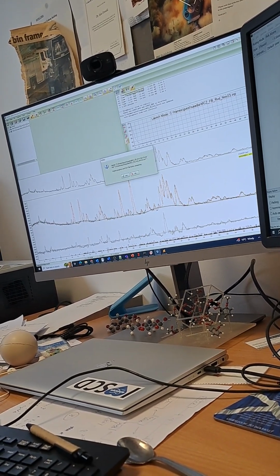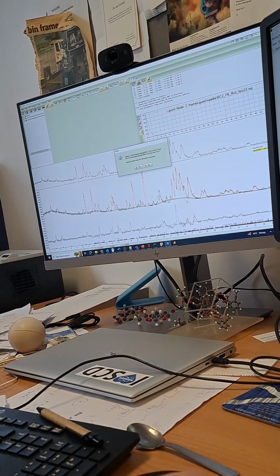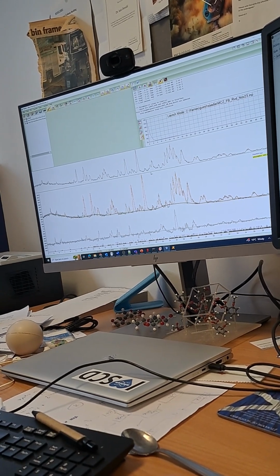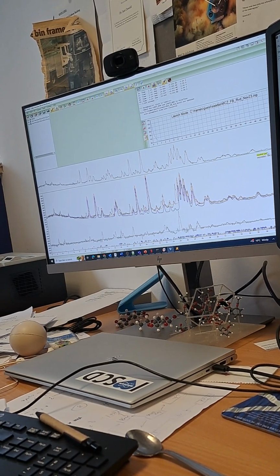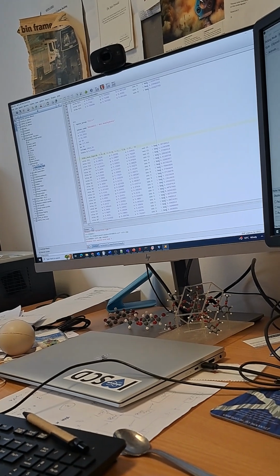How well is that done? Not at all well. Okay, it's not gone well at all. So we've not been able to do that. We've not been able to achieve what we're wanting to achieve. So for background, we might need to add more. So the background is for everything. Okay, you don't have a background separately for each of them.